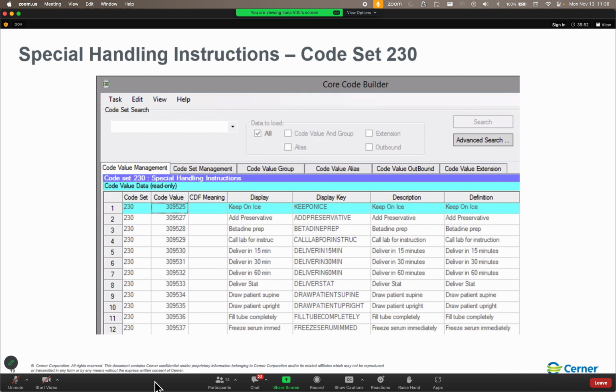You could have all of those grouped to where they're pulling from your outpatient pool, and then you could have another pool for one hospital's inpatients and a third pool for the other hospital's inpatients. You could totally do that. So again, each site gets its own site prefix, but multiple sites can share the same pool. So Christian, does that make sense?